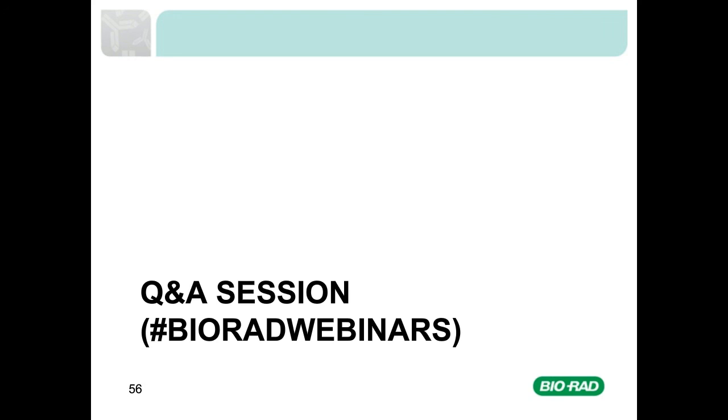Okay, some of the non-denaturing elution methods could potentially preserve the complex or at least some of the interactions. However, in addition to running those IP samples on a denaturing SDS-PAGE gel, you might also want to consider running samples on a native gel. Now, a native gel doesn't contain SDS, and so the proteins are in their native conformation, they retain their native charge, and they also retain any interaction with other proteins. So this method might therefore give you an idea whether your protein is part of a complex.